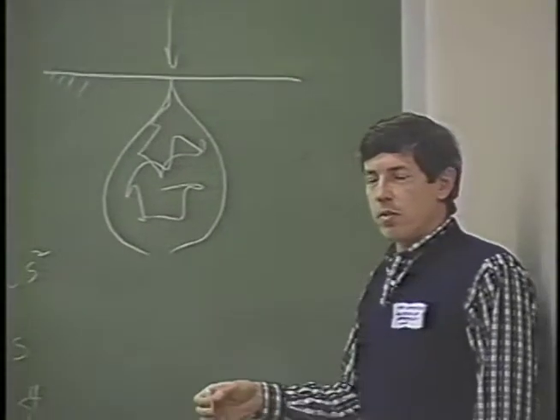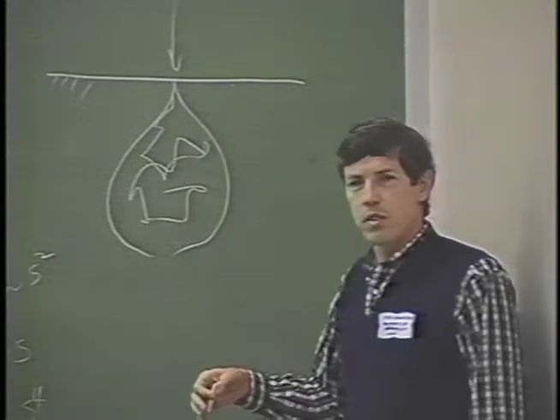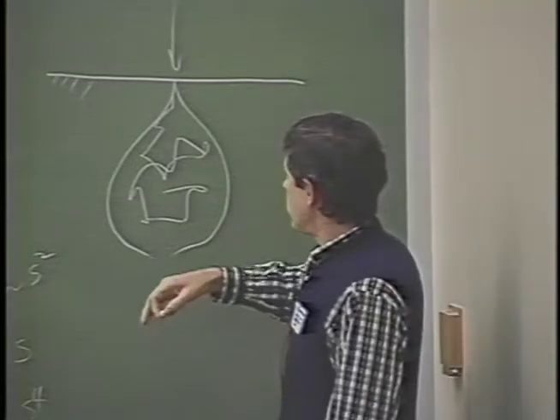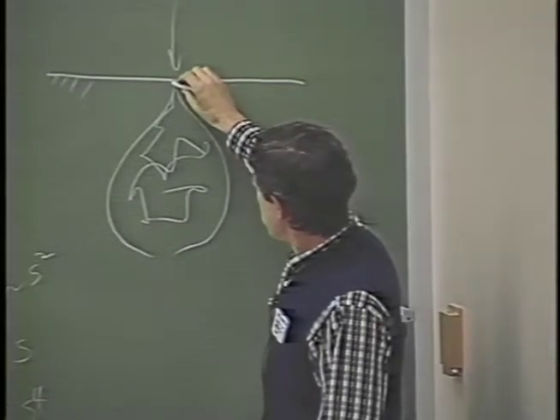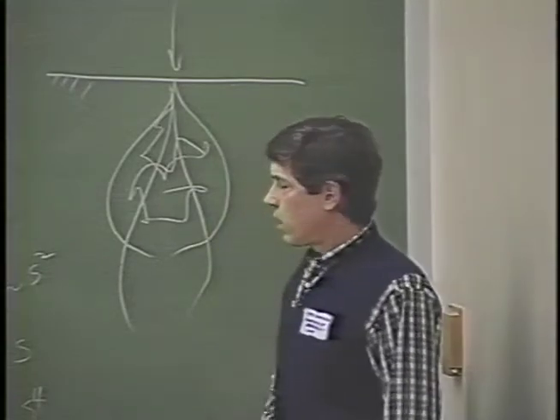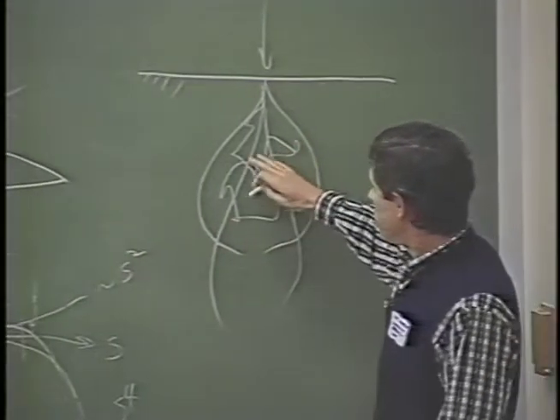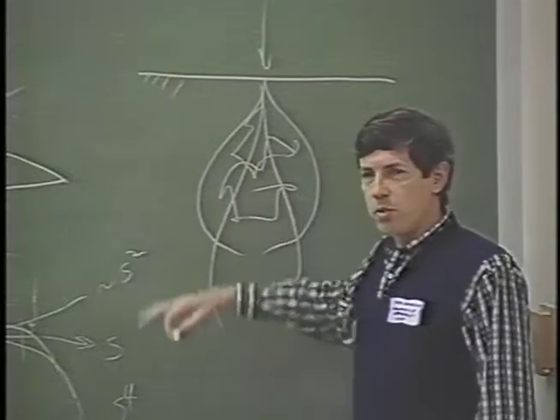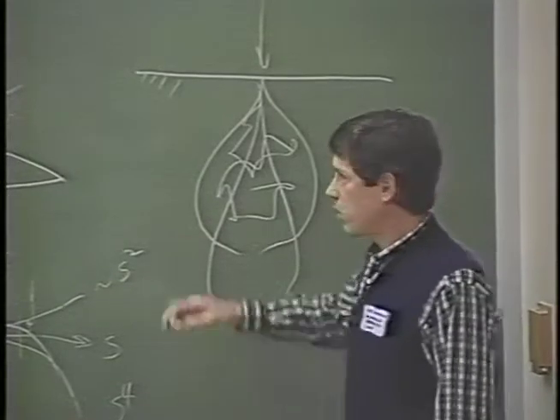Now, if the electron has a higher energy, that means two things happen. One is the shape of this teardrop changes to something like this here. And the other is that the narrow region of this may actually extend through and out the other side of the emulsion that contains the silver halide grains.